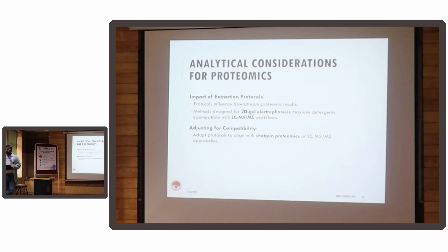So, of course, just like we discussed, we have to think that the extraction protocols should not influence the downstream results. One approach people usually try to follow is, sometimes somebody would have done a 2D gel electrophoresis study some 15 years back, and you want to do an LCMS based study, and you will want to use the same protocol.